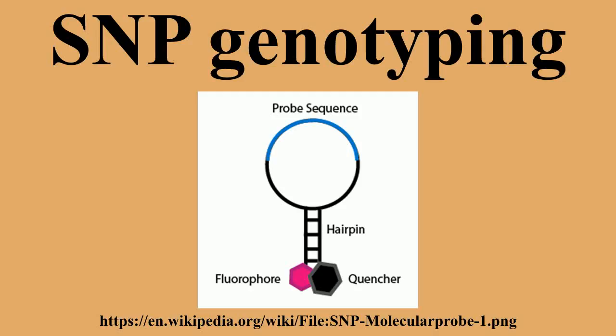SNP microarrays. In high-density oligonucleotide SNP arrays, hundreds of thousands of probes are arrayed on a small chip, allowing for many SNPs to be interrogated simultaneously.